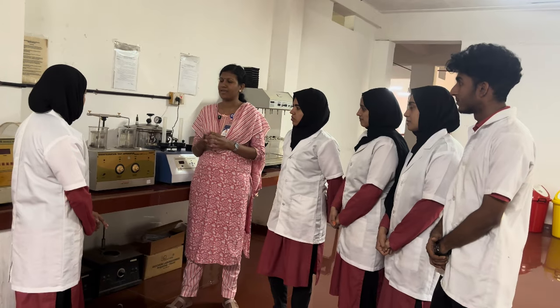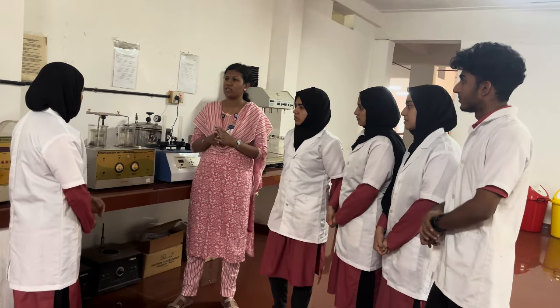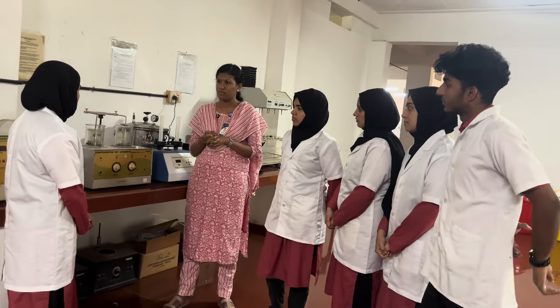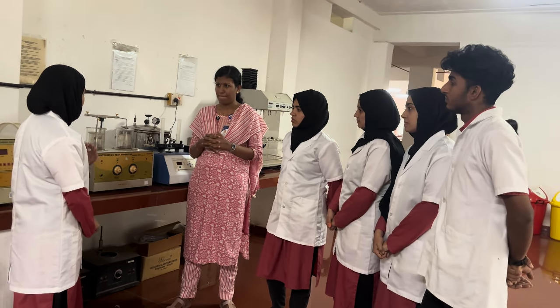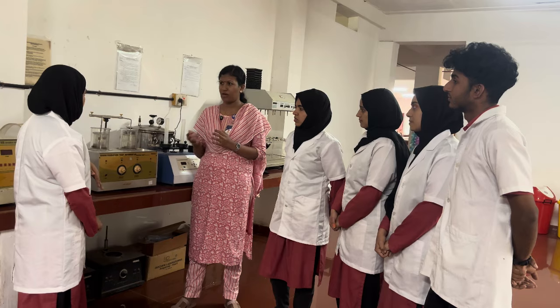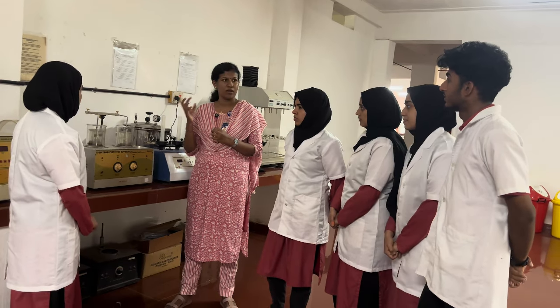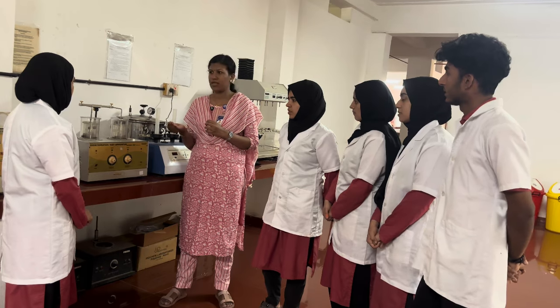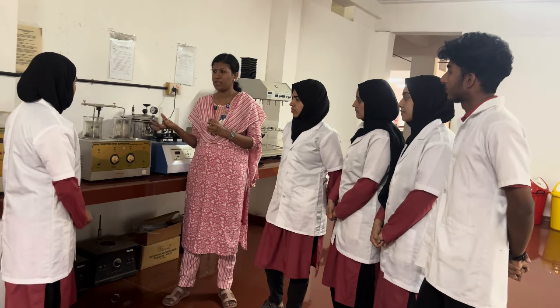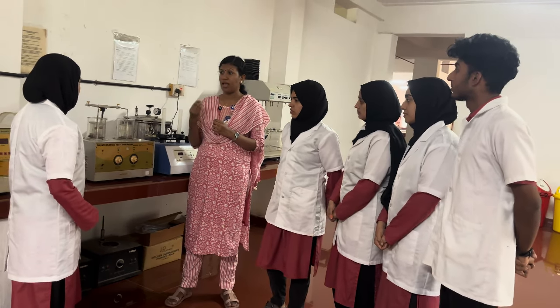Okay, so what is disintegration? Why are we doing the disintegration test for tablets? What is disintegration? Breaking down. Okay, so breaking down of a tablet into small particles, that is called disintegration. Then we are measuring the disintegration time.